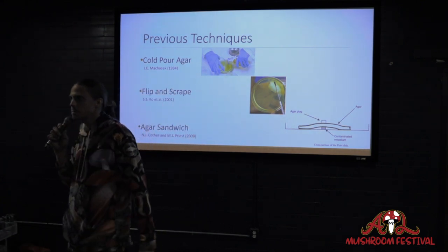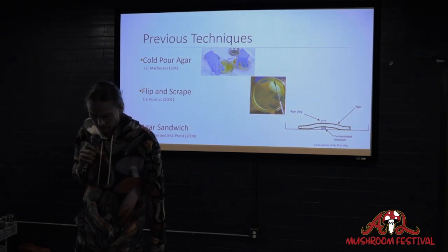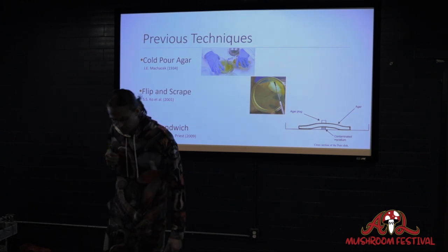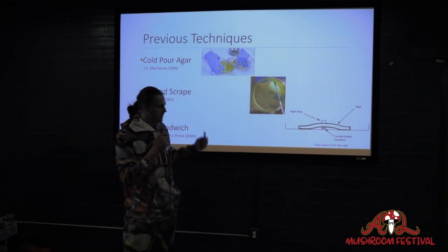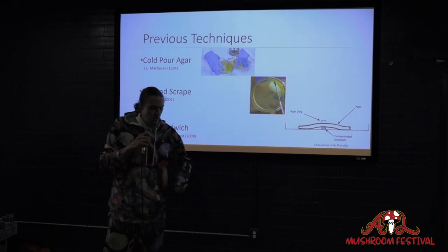Yes? Am I correct in understanding that in all three of these techniques, the assumption is that the correct mycelium will grow faster than the bacteria through the agar? So the question was, is the assumption behind these techniques that the mycelia would outrun the contaminant?